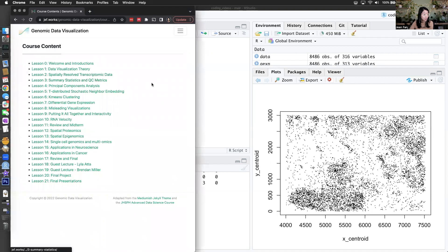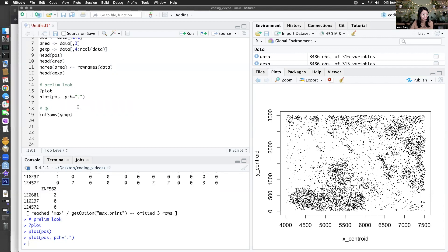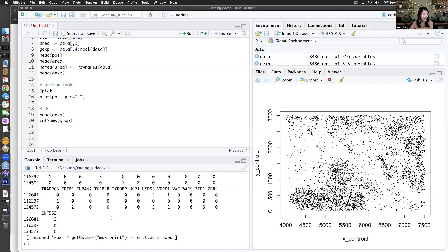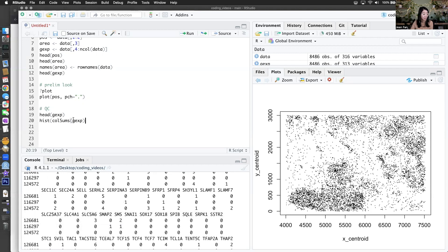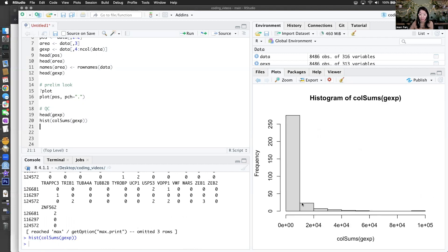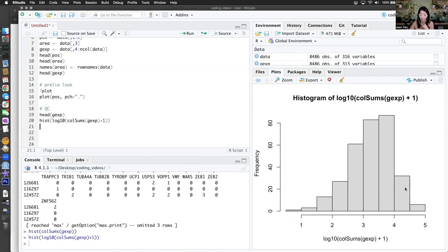Let's do some summary stats and QC. If I look at the column sums, that gives me how many counts for each gene across all cells. Some genes are super high, some are pretty low. If I put this on a log scale and add a pseudocount of one to prevent infinites — okay, that's a little bit easier to interpret. There are some genes detected at 10 to the five copies across all the cells. I could make it a binary greater-than-zero to count the number of cells that have each gene detected.